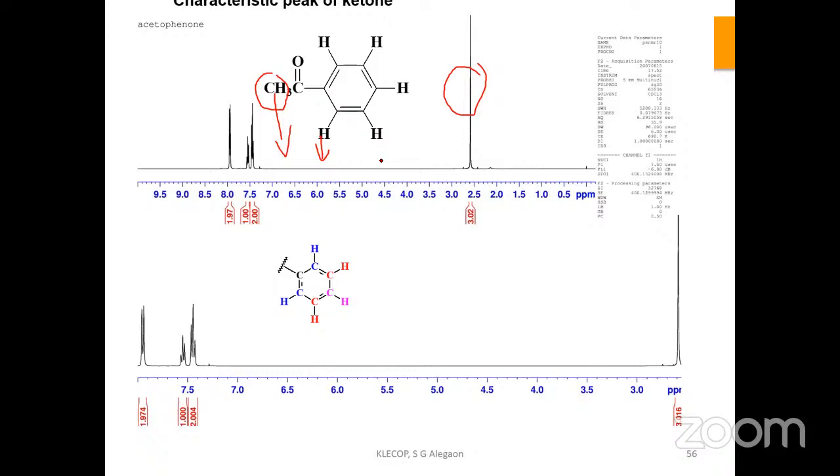That time we are going to understand how, in an ortho compound, they are going to have an intramolecular hydrogen bond. Usually we can understand this in salicylic acid and other compounds, where we are going to observe a small hydrogen bond character.